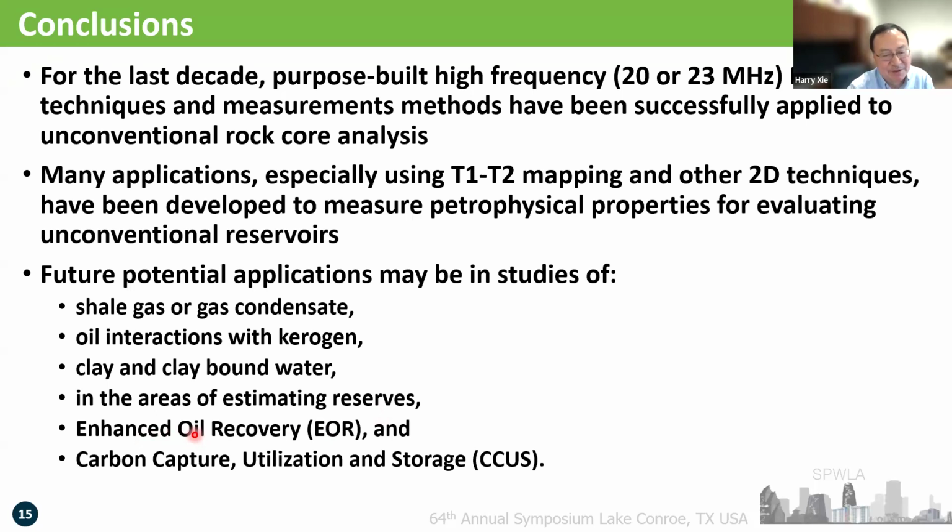There was no way to measure it, but NMR can provide such a way. So you can measure what's remaining in the rock and what has changed in the rock. And especially in the future for carbon capture utilization and CCUS, NMR can play a big role as well. So it depends on how you want to use NMR and what you want to measure.